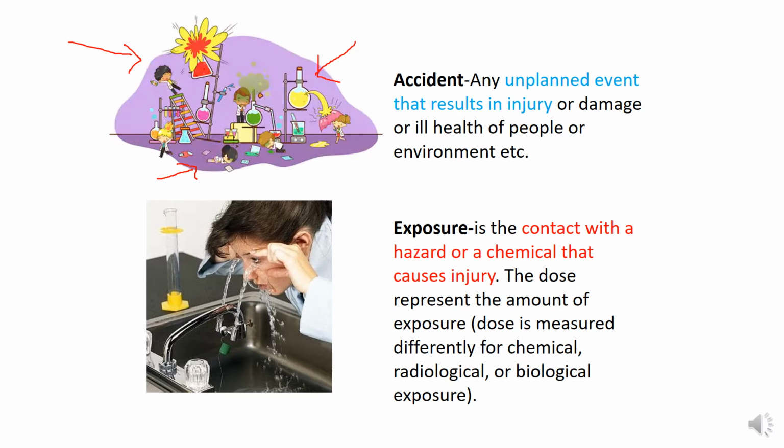And then another term, exposure. This is also very commonly used because we use different chemicals or maybe different radiations in certain labs. So for exposure, we also use this terminology. It is the contact with the hazard or the chemical that causes injury. Then, of course, for exposure there are certain exposure limits, which we call the dose or the limit.